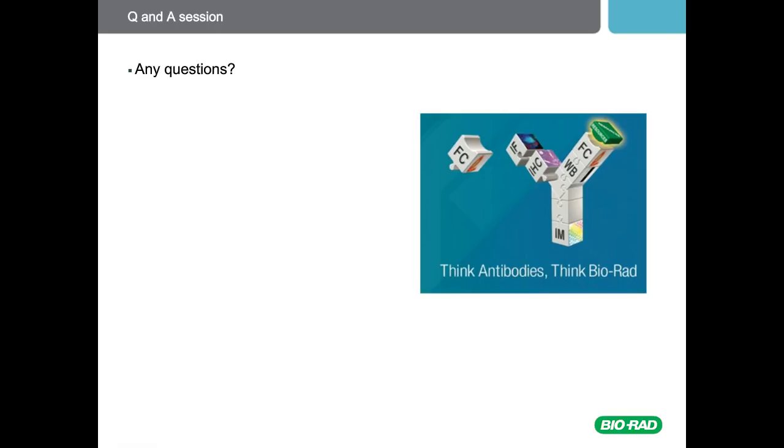I have another question here. Is it compulsory to use isotype controls? Well, the short answer to that is no. However, you may wish to include them in your protocol.